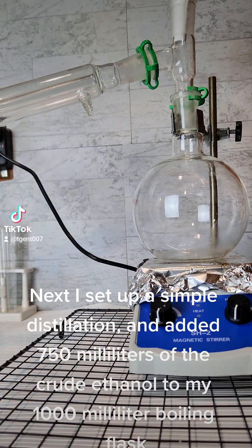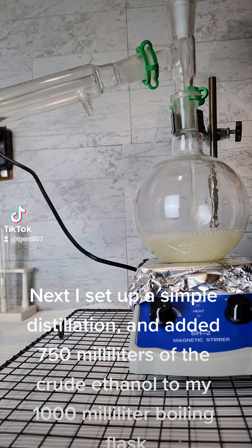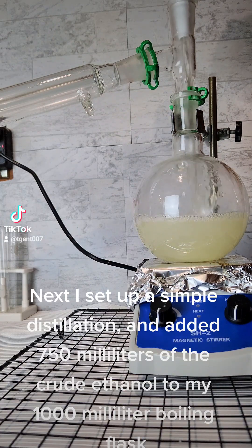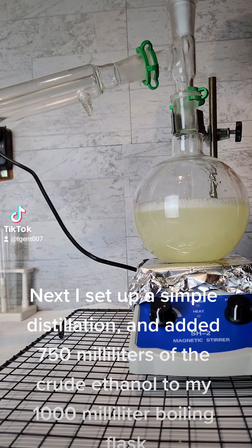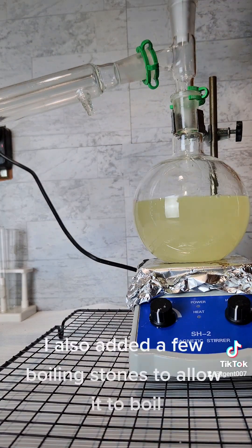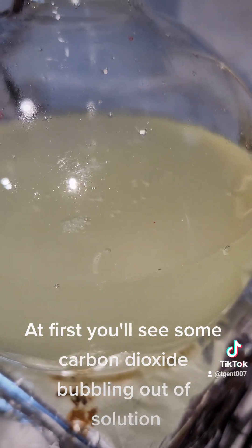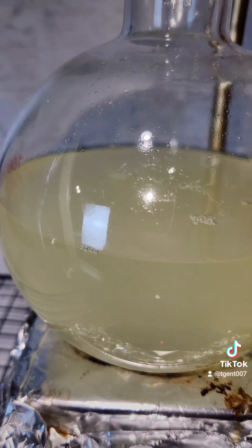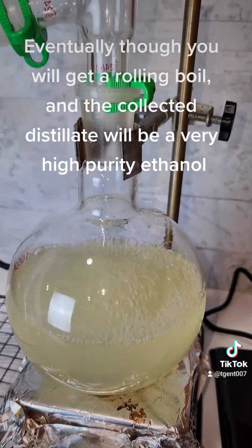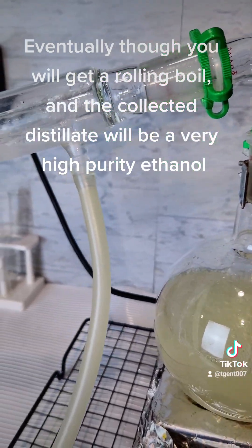Next I set up a simple distillation and added 750 ml of the crude ethanol to my 1000 ml boiling flask. I also added a few boiling stones to allow it to boil. At first you'll see some carbon dioxide bubbling out of solution. Eventually though you will get a rolling boil and the collected distillate will be a very high purity ethanol.